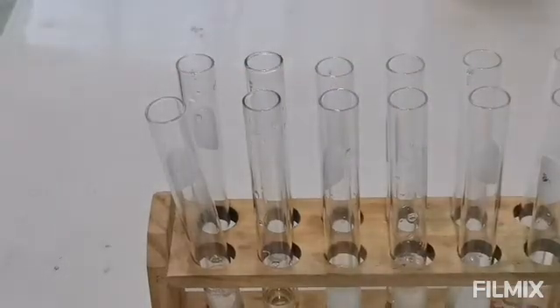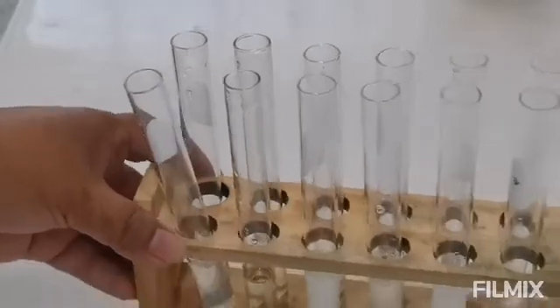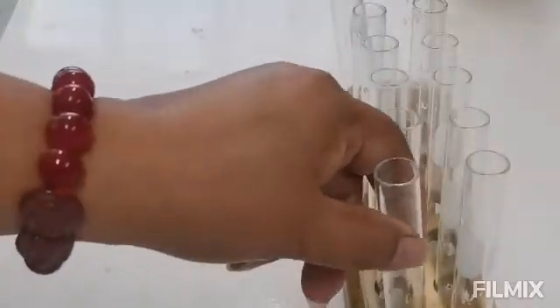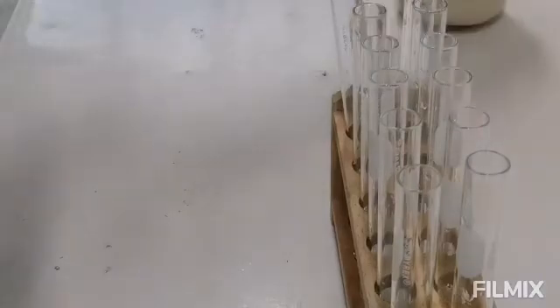Okay, that is for the exercises or activities for the denaturation of protein. Now let us go to the test of protein. In the procedure of the test of protein, to a sodium hydroxide solution, you're going to add your beef extract or your egg albumin, and then the copper sulfate solution should be added, and then let us try to see what will happen.